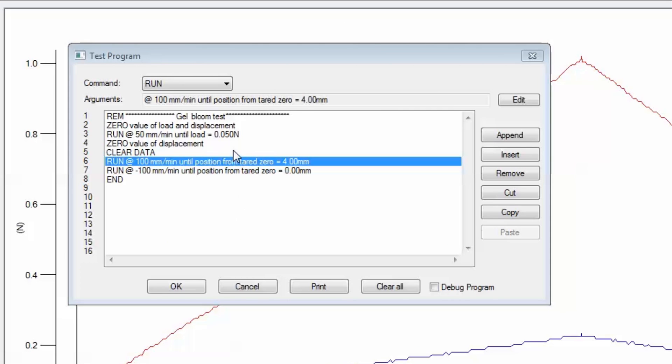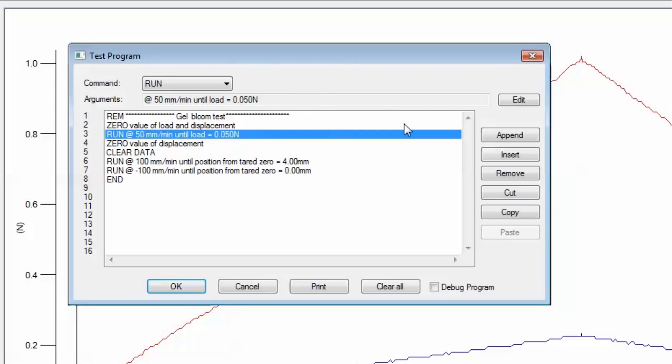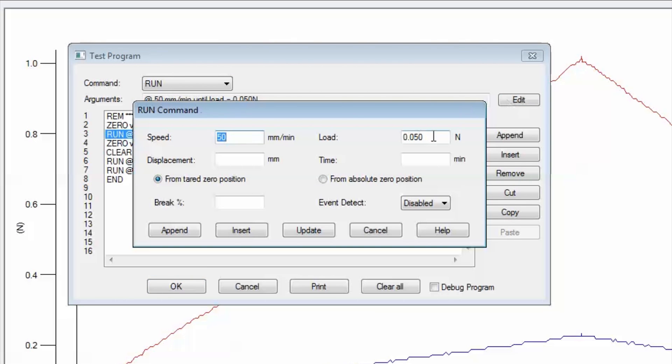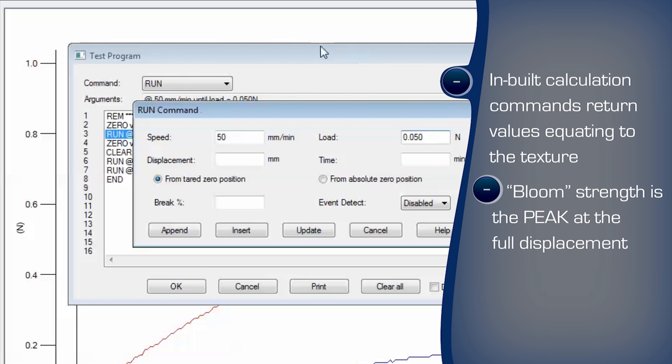A suitably rated load cell is selected to maximize measurement accuracy. The automated test program is easily written with the familiar Windows-based environment. Commands are selected to perform each of the steps. The gel strength is calculated from the peak force, represented in grams.